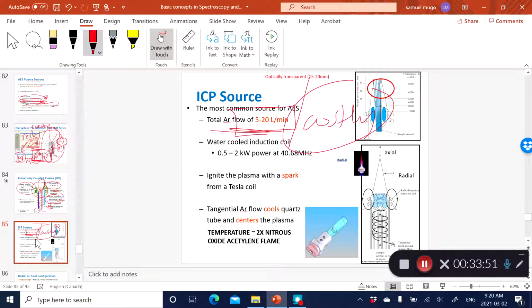And that's why you saw us in the lab. Actually, we had to pool all the samples together, so that we reduce the amount of gas that we are using.